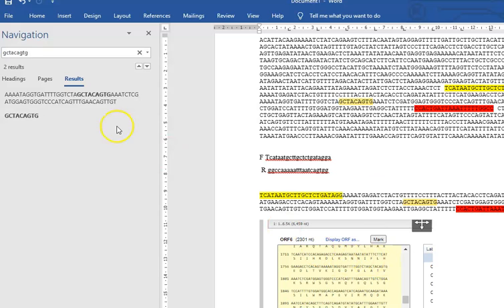Okay, I've just used the search function for this little sequence, GCT ACA GTG, and that GTG is the valine codon, and that comes from this little region here. So it goes where my arrows are, GCT ACA GTG, and if you read this sequence backwards, it perfectly matches this sequence here. So that run of 4 T's is that run of 4 T's. So we know that these primers will amplify this region of the BRAF gene, and within that there is DNA that codes for codon 600 right in the middle of that PCR product.